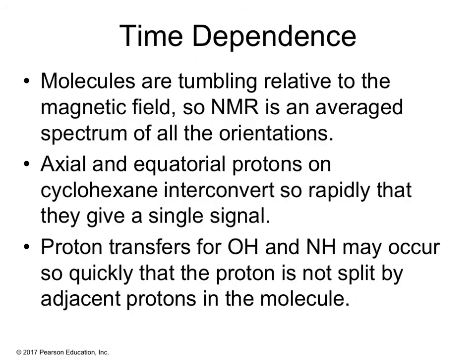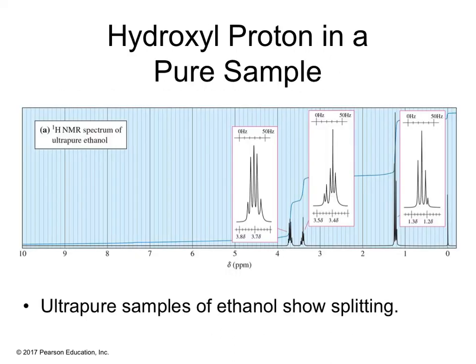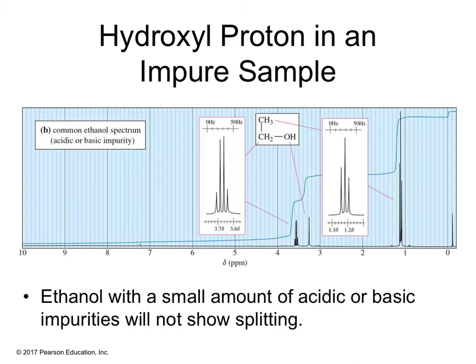Time dependence NMR, you can do different timing. This is showing you that if your sample is pure and concentrated, you can see splitting patterns that you wouldn't normally see. And they're showing you the difference between a pure sample and an impure sample. We used to say at Eli Lilly, if you put trash in, you get trash out. That means you need to purify your compound, you need to drive your reaction to completion and get a good NMR spectra.